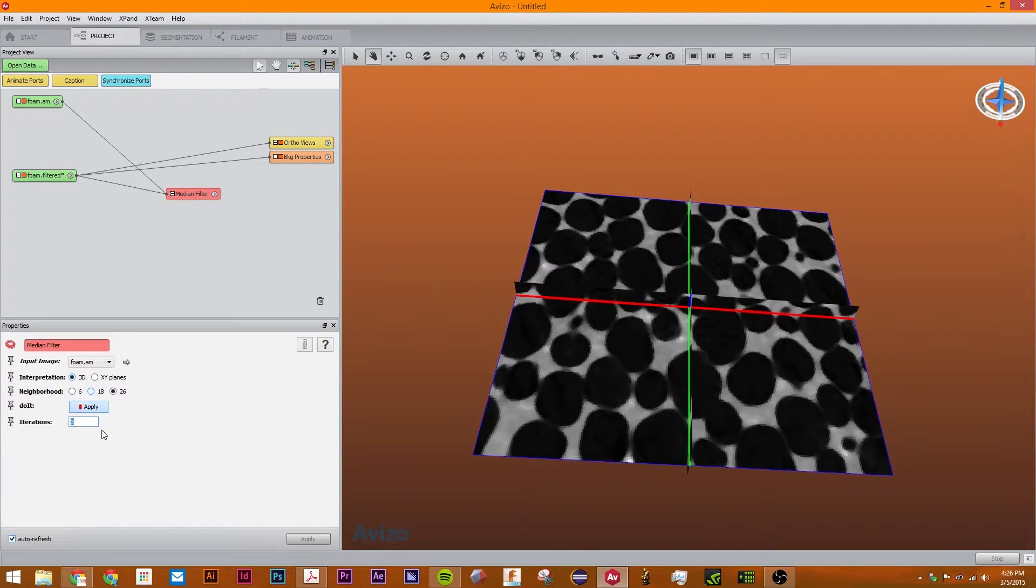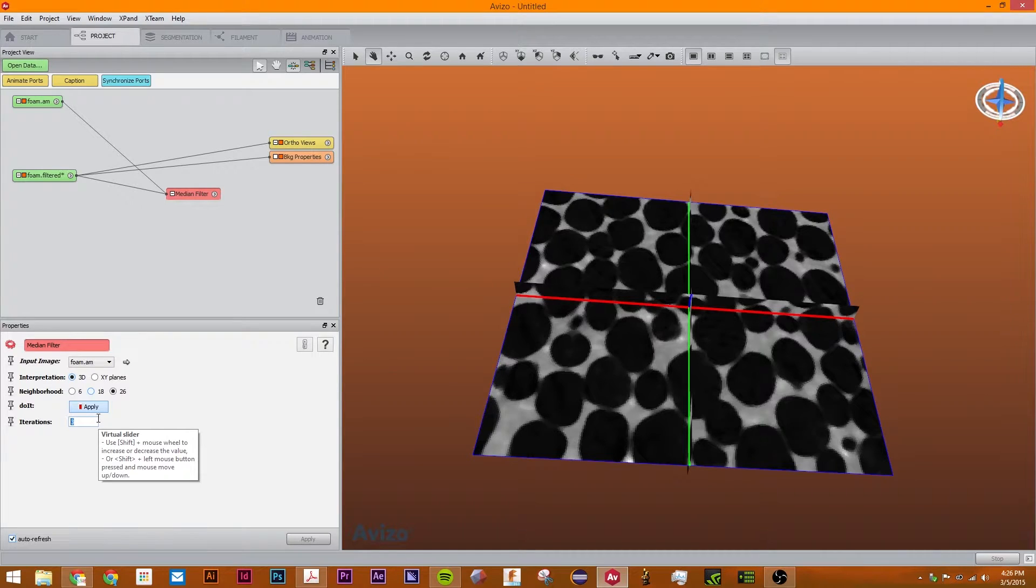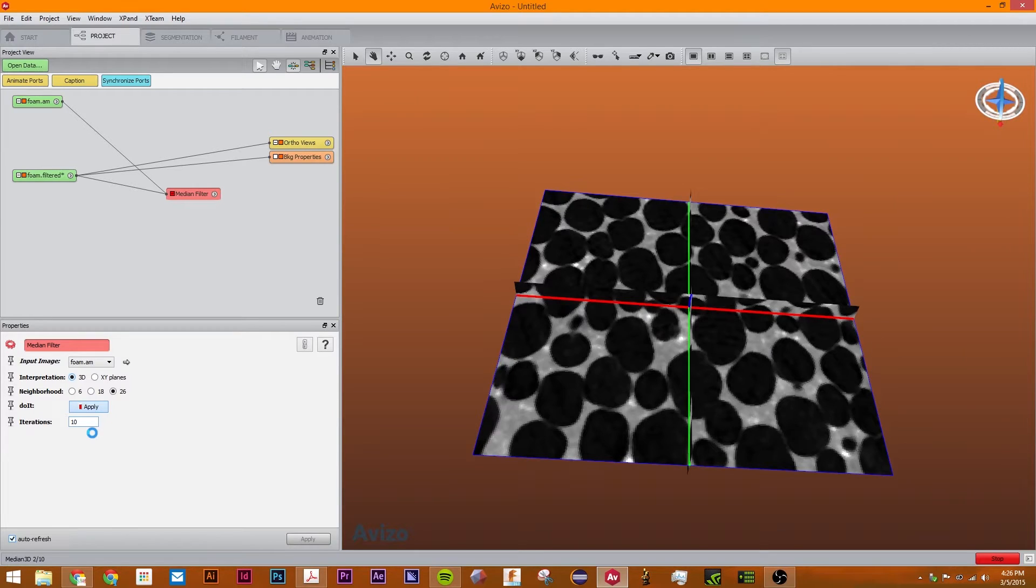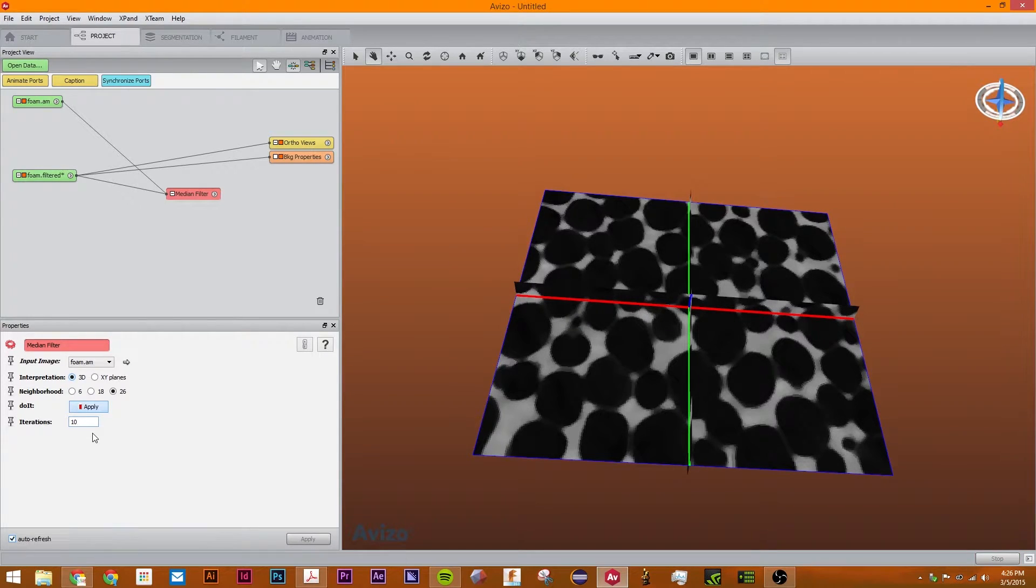You can change the number of iterations so that means how many times it does the median filter. So 1 does little and 10 does much more. Okay. I'm going to leave it at 3.